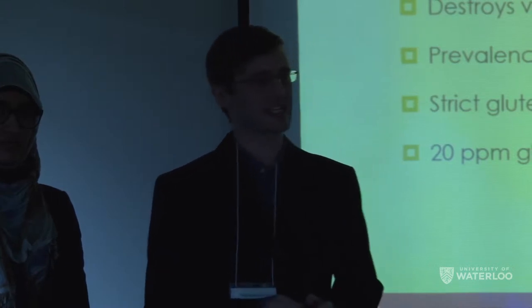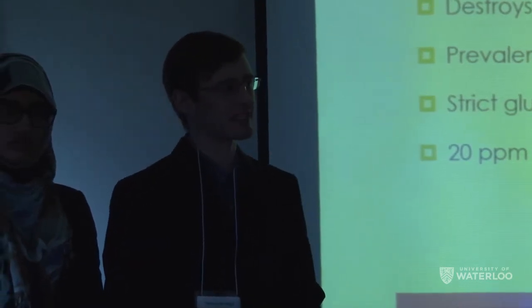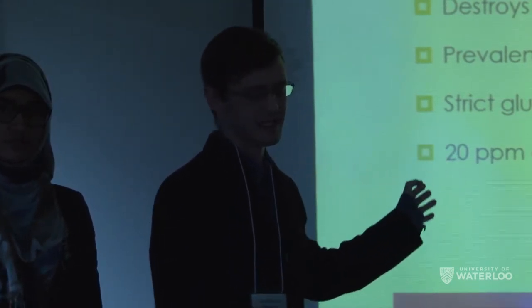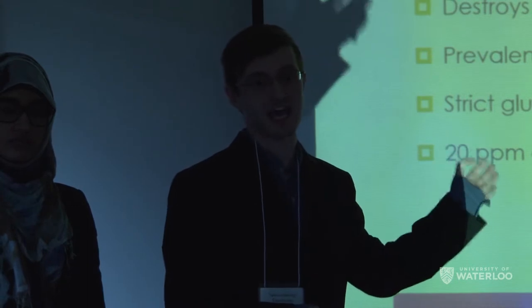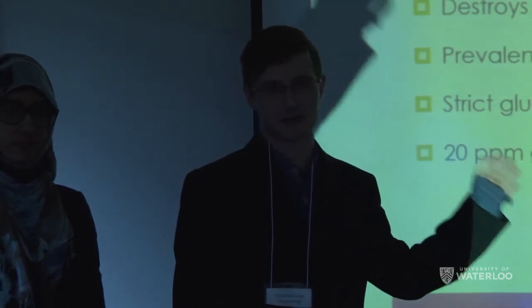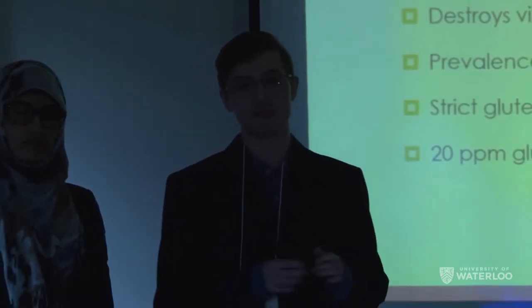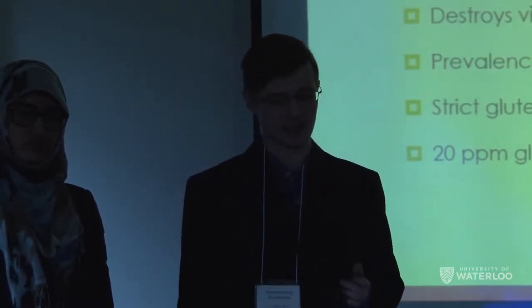For something to be classified as gluten-free, it must contain less than 20 parts per million of gluten. Any more than this, and gluten will begin binding to the villi, and the body will then attack the villi to get rid of the gluten. And that leads to the celiac progression. So we've picked 20 parts per million as the detection limit for our sensor.